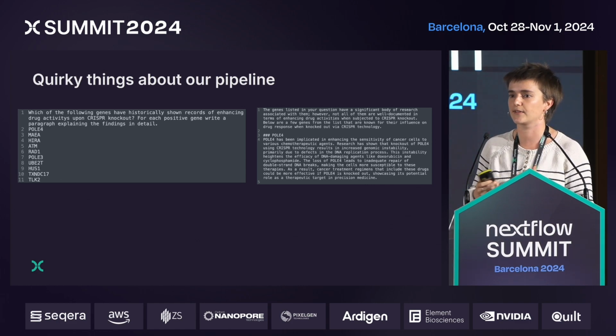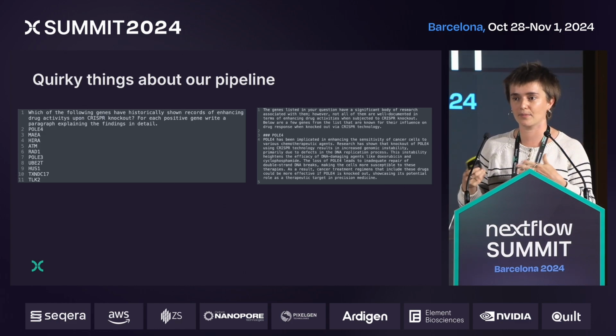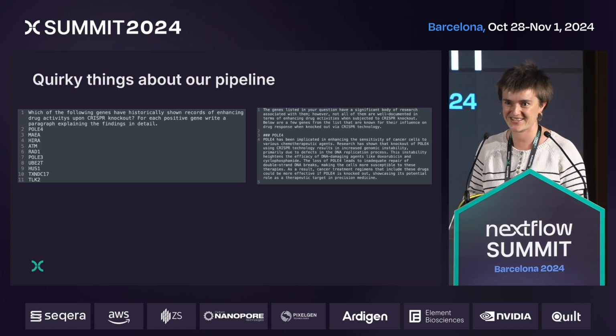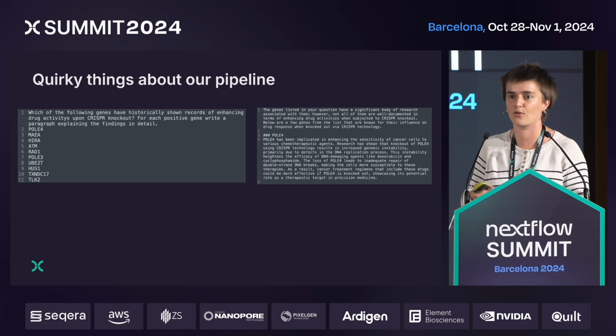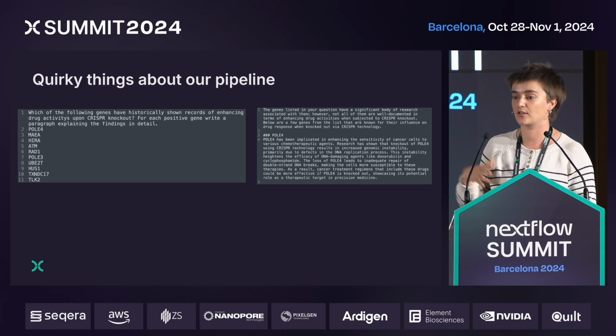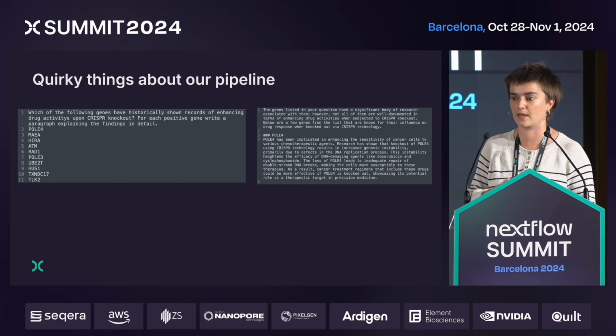So we want to assess the quality, and for us it is also the first time that we start from FASTQ files and have a complete downstream interpretation. The next step is: is this interpretation actually good? And also with the development of different LLMs, we'll be able to track the quality. For now, if I had to criticize this, LLMs are not reproducible, but we do assume that they will be soon, or that different LLMs will pop up. So right now this is a GPT LLM, and we are currently integrating it in the pipeline.